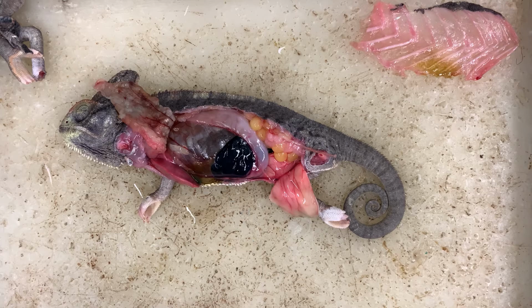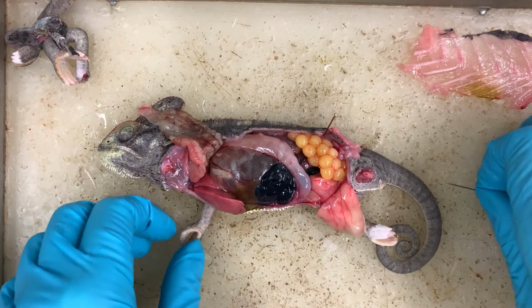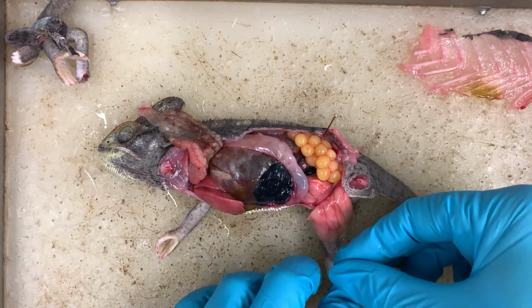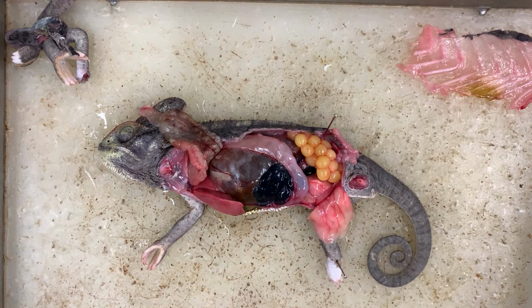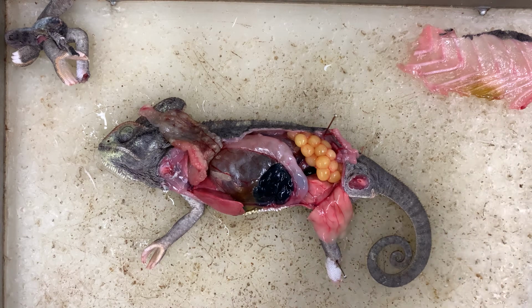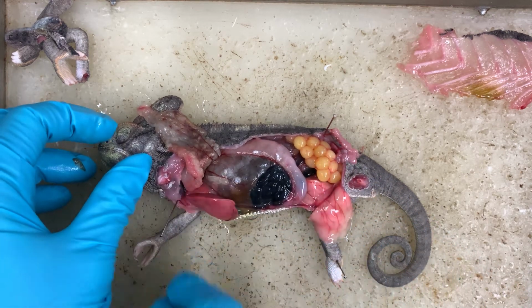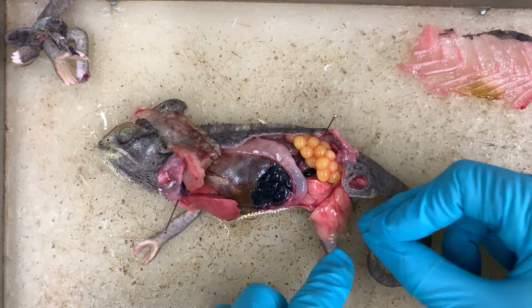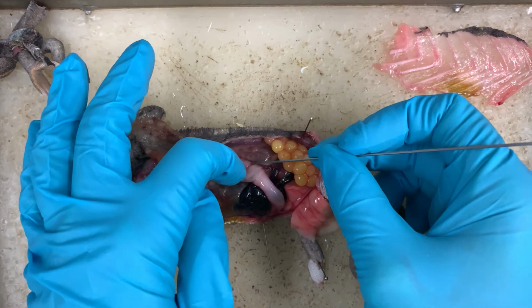We now pin the animal in place in order to manipulate the organ system. To access the digestive system, we cut through the mesenteries.